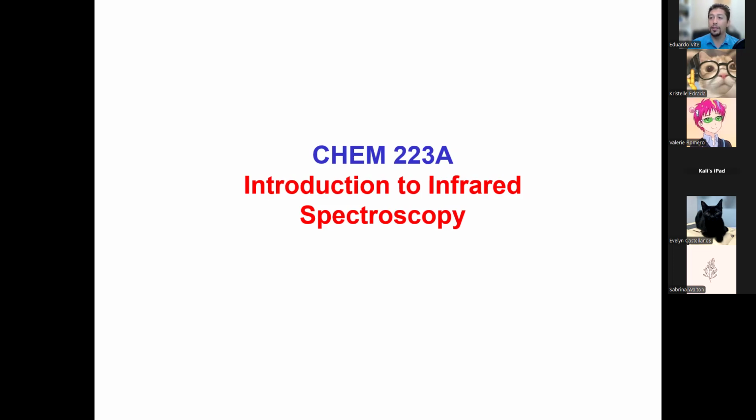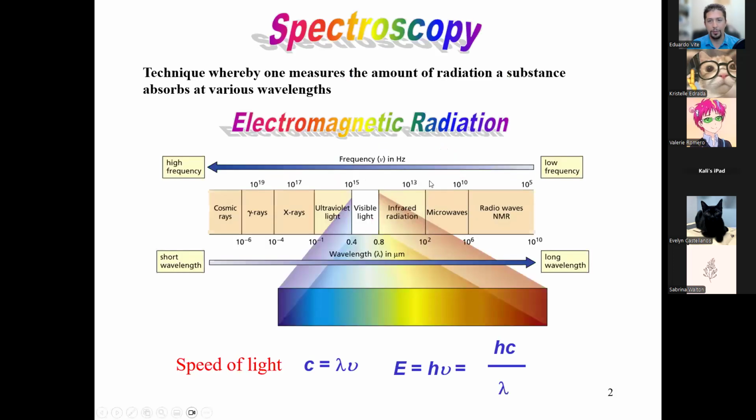So your first pre-lab quiz question was, what does IR stand for? It is infrared radiation, IR. Some people say that the I is inf and the R is rared, but that's not true. It's infrared radiation, IR radiation. IR spectroscopy is infrared radiation spectroscopy. So that would be the first question there. So what do we mean by that?